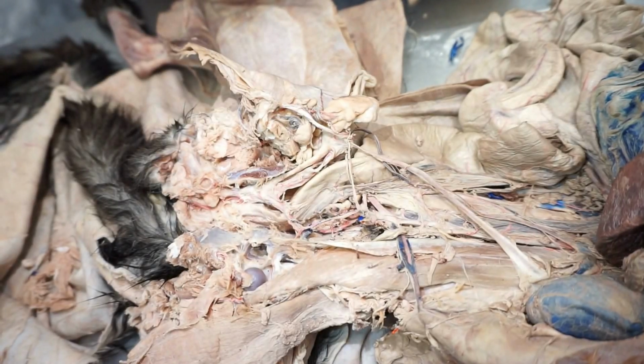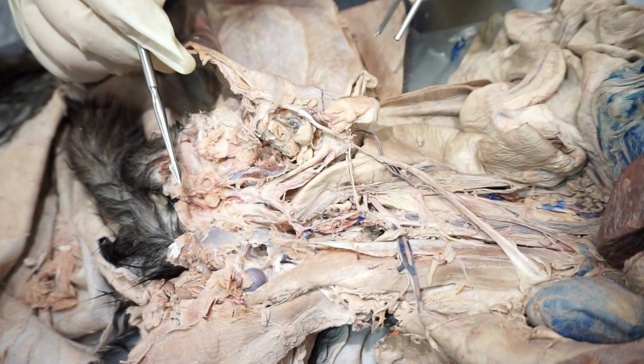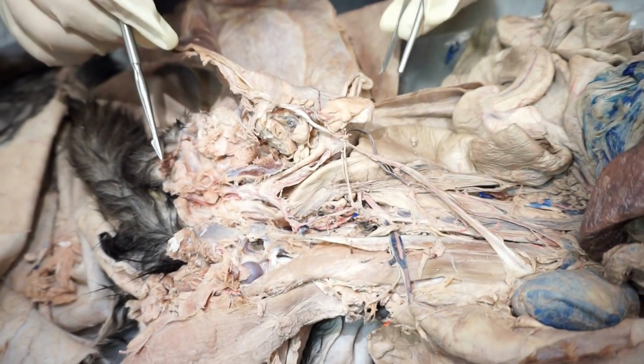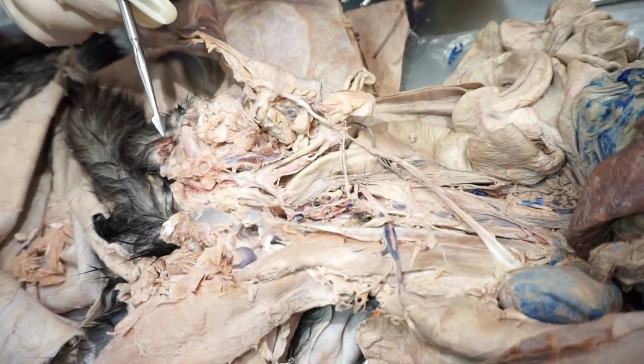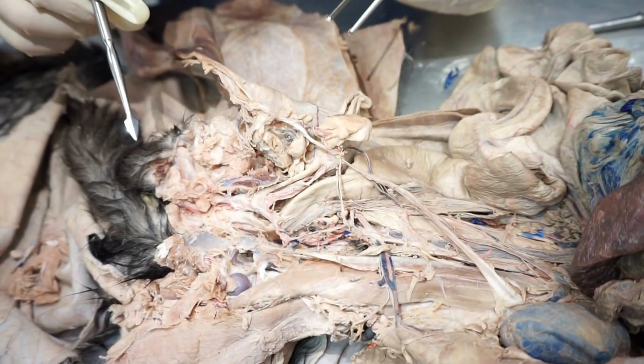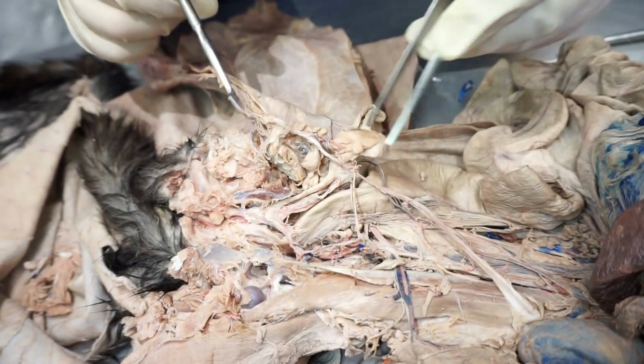In this video, we're going to be looking at the pelvic cavity of a cat, specifically a male cat, and talk about the arteries, nerves, and some of the accessory sex glands and unique kitty cat features.